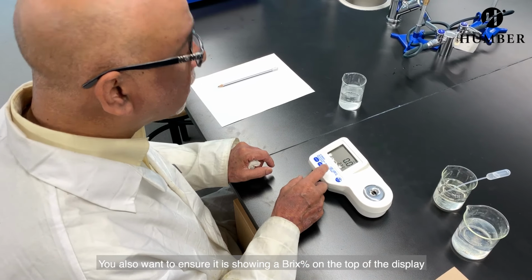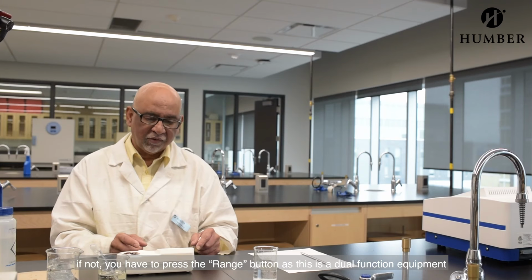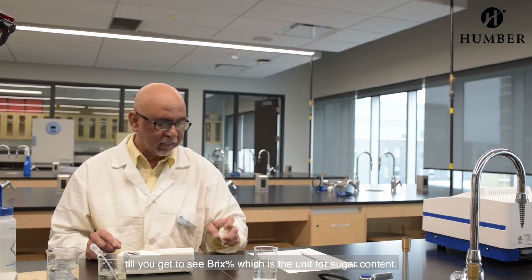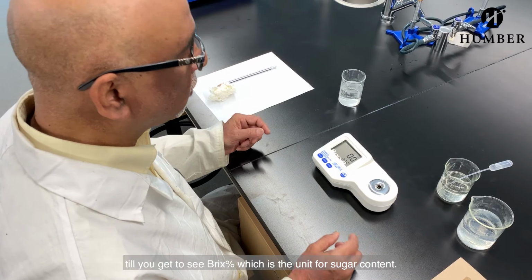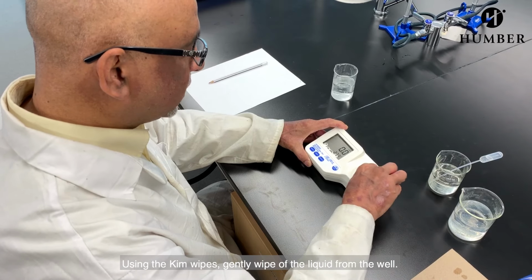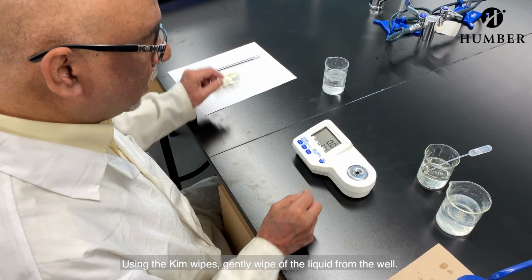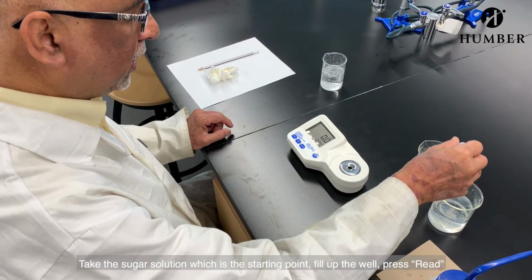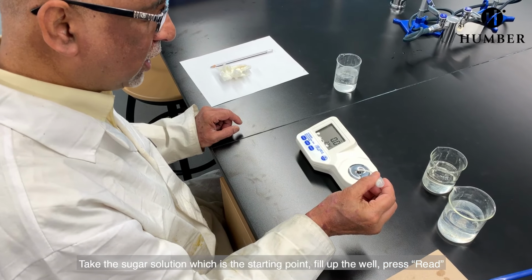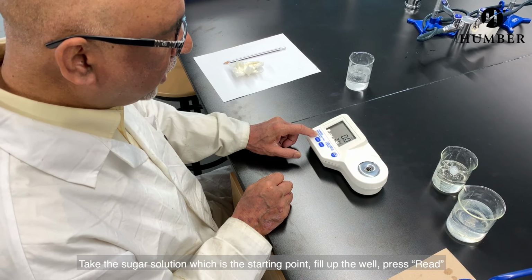If it does not, then you want to switch the range, because it's a dual equipment and it can give you the refractive indexes as well. So you want to make sure it is showing you percentage Brix, which is the unit of sugar. Using the Kimwipes, we gently wipe off the liquid from the well. And I'm going to take the sugar solution which we are going to use. It's like the virgin sugar solution or the starting point, and we fill up that well and we press read.